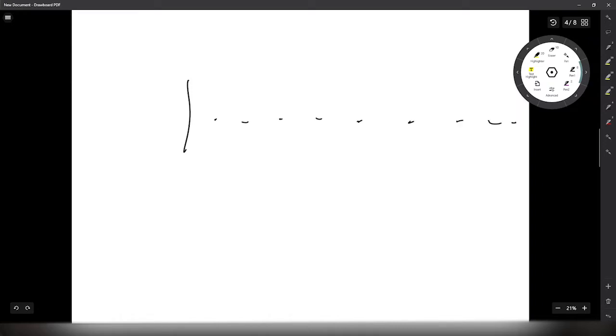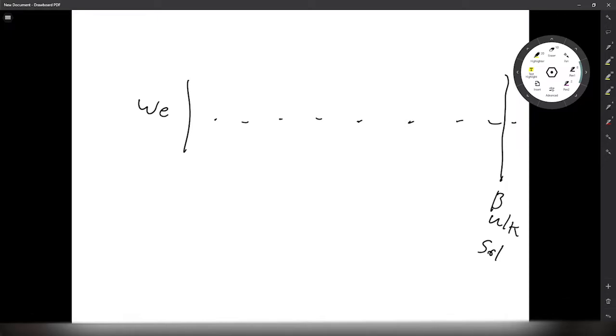So if you're simulating, with this being the working electrode and this being the bulk solution concentration of a region of bulk solution, you will simulate X number of spatial points in this region, generally at different positions or an expanding grid for accuracy.